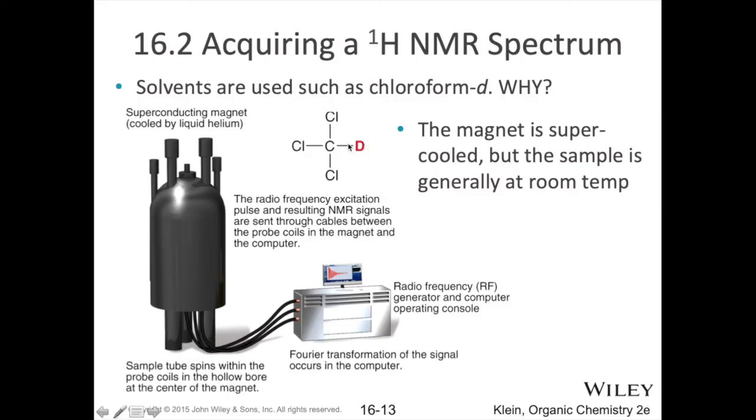All right. For those of you who don't remember, deuterium is hydrogen-2. It's an isotope of hydrogen that has an extra neutron. That gives it a mass number of 2. So remember, you need an odd number of nucleons for your atom to show up in your data, right? If you have an even number of nucleons, those atoms don't really interact with your magnetic field.